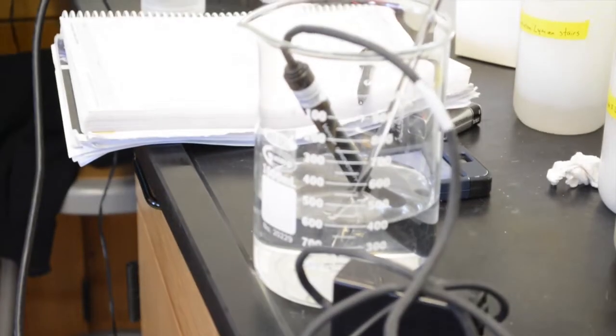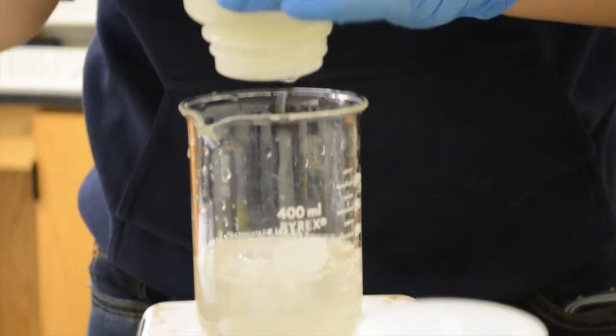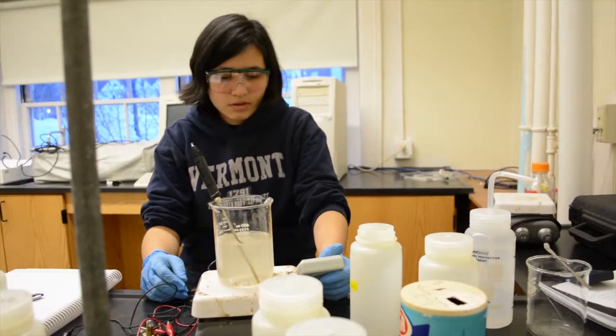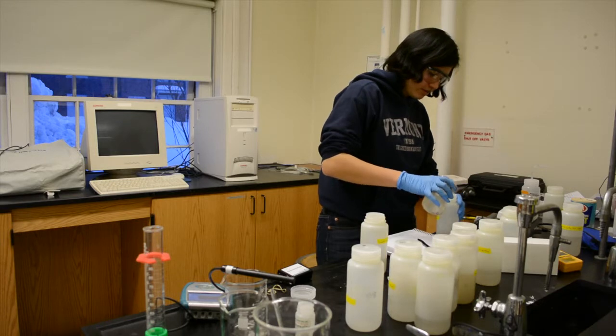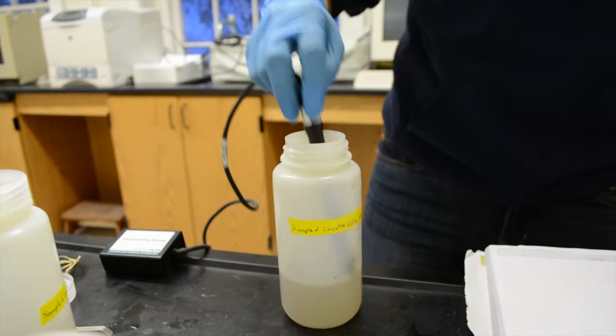A total of 11 snow samples and 1 Poultney River sample were acquired to measure the conductivity. All samples were heated and stirred on a hot plate using a stir rod to measure the conductivity of the samples. To find accurate measurements, the temperature probe was used to attain a temperature of 25 degrees Celsius. When all samples reached 25 degrees Celsius, then the conductivity was measured.